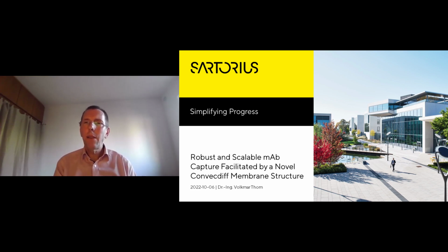My understanding is that the Gore membrane has a synthetic hydrophobic polymer as the base matrix, where the diffusive phase is embedded into, and this might lead to adsorption and fouling, and this might be a major difference here to our system.